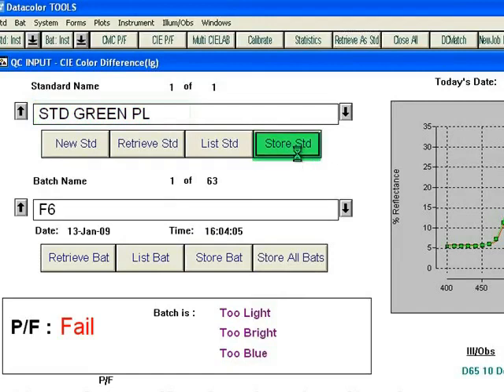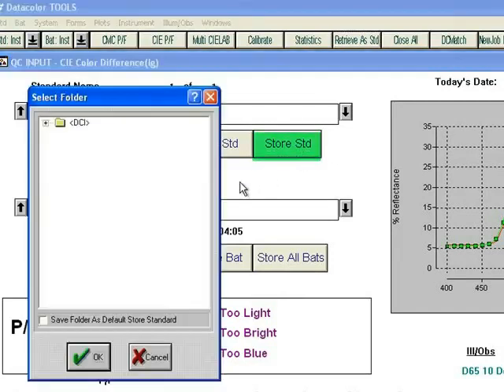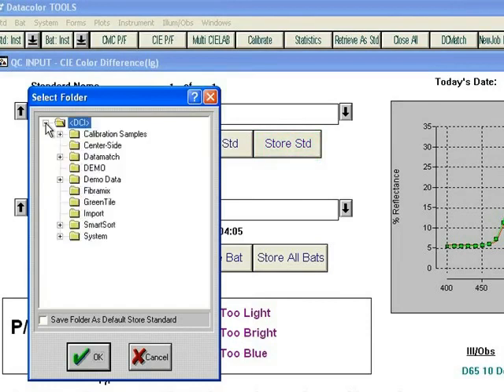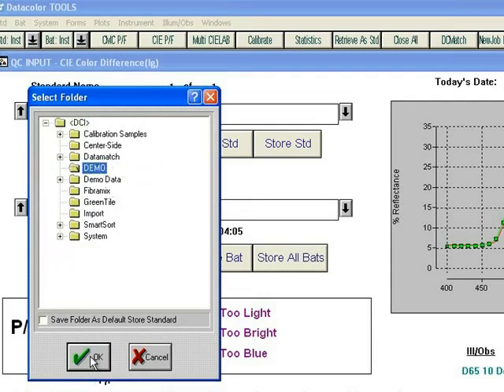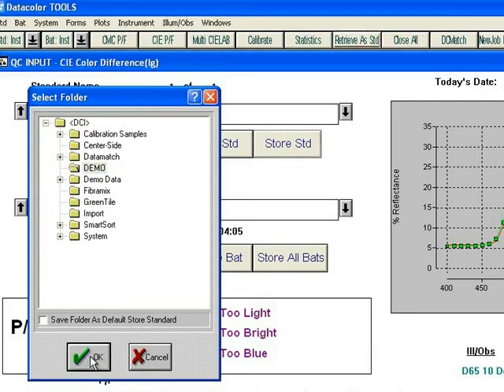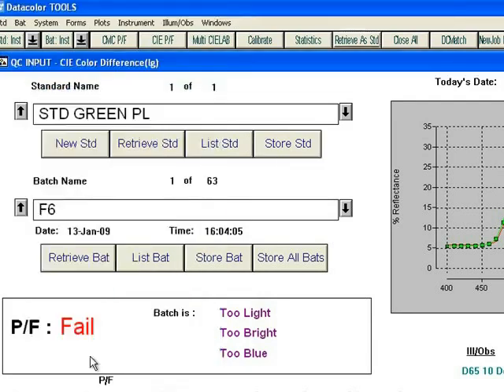This opens a window showing your available folders in the database. Highlight one of them, in our case Demo, and click the OK button. The standard is now stored in the Demo folder.